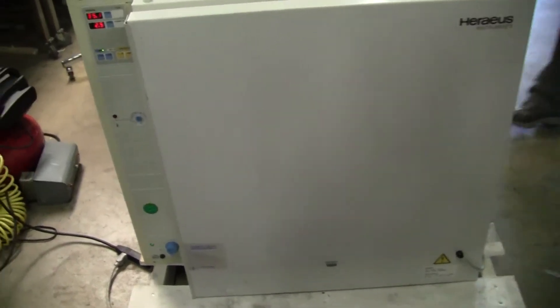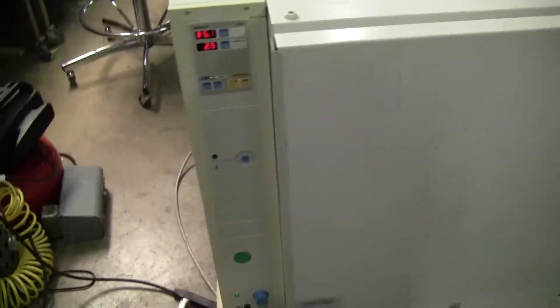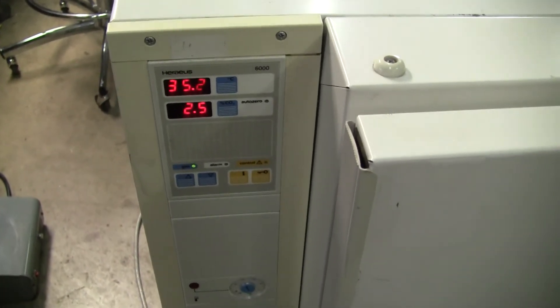Hi, this is Michael Naitow from High Tech Trader. Today we're looking at a Horeas BB6220 CO2 incubator. It's heating up. There's your CO2 setting.